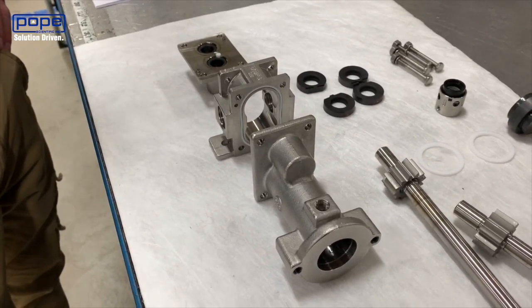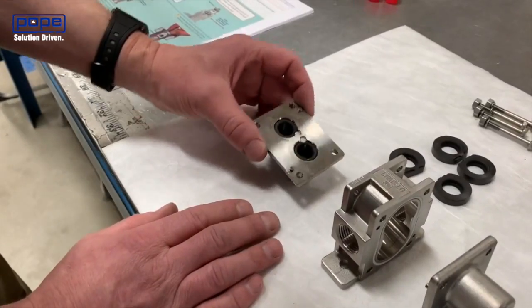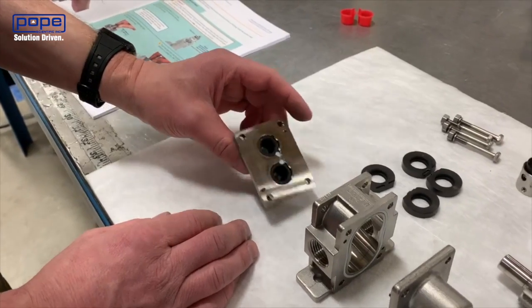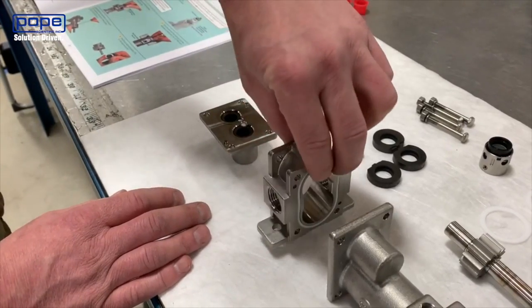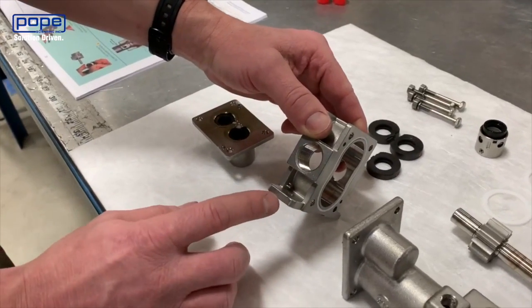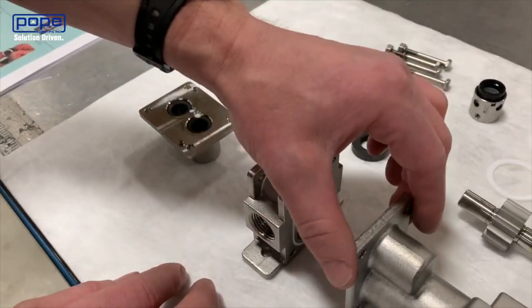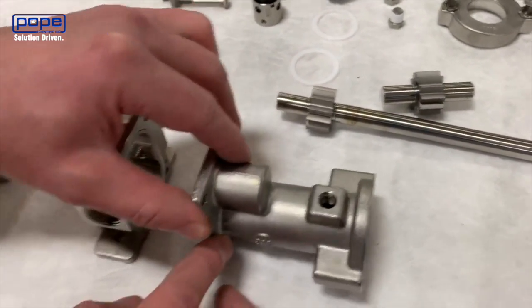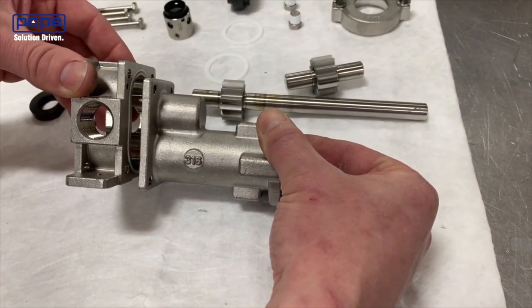Before putting the housing pieces together, let's go through the orientation. On the rear housing, the orientation doesn't matter — it can go either up or down. On the center housing, you can also place it either way. However, there are a couple of orientation pieces you need to be careful about. You want to make sure that if your feet are facing downward — where you actually bolt the pump in — the long side of the front housing is in that same direction. So with the feet down, the long side of the front housing should also be down.